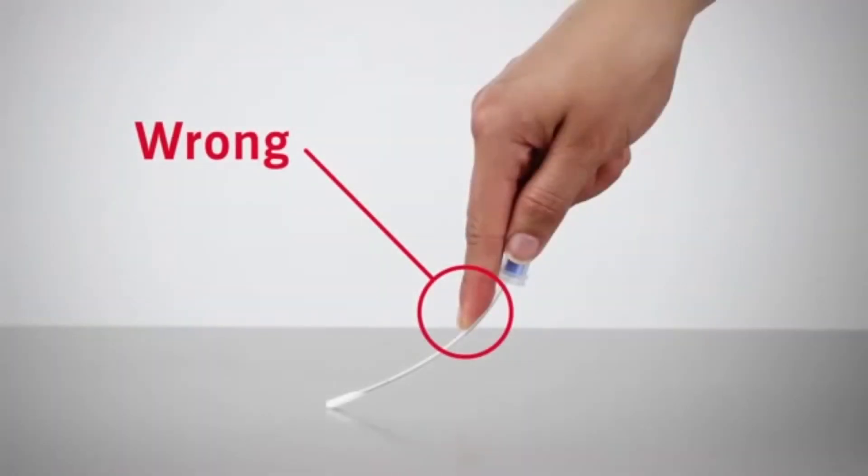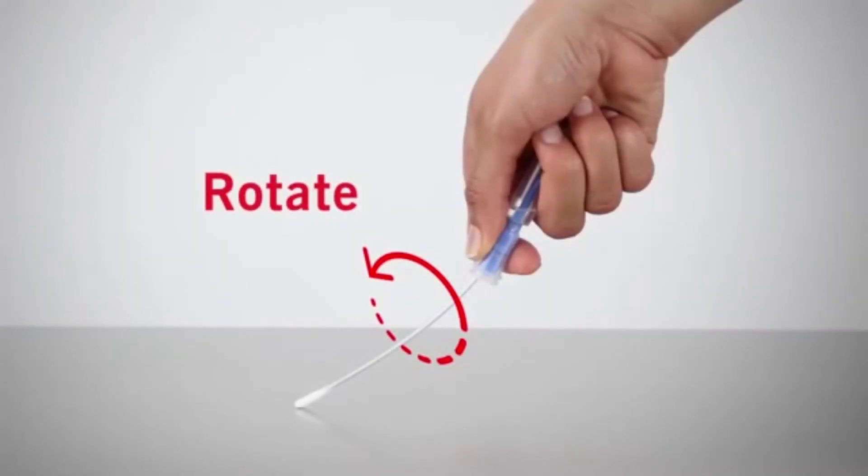Be sure not to touch the swab shaft when collecting sample. This could contaminate the test and cause inaccurate results. Rotate the swab tip while swabbing to ensure maximum sample collection.